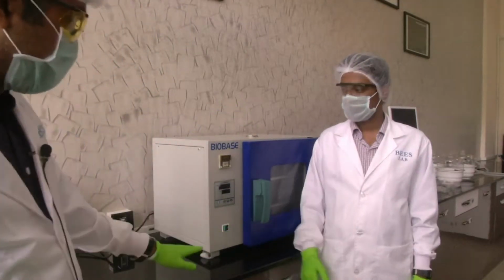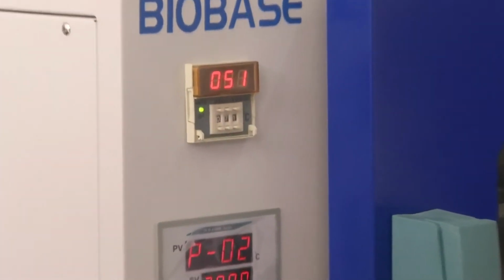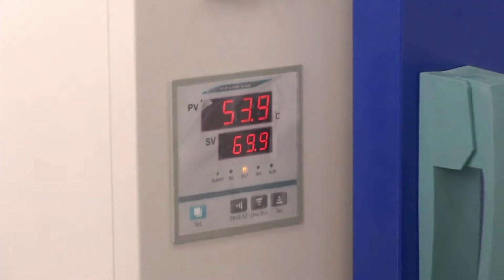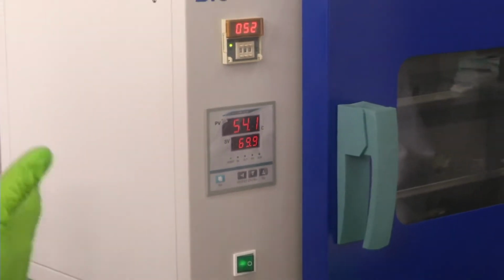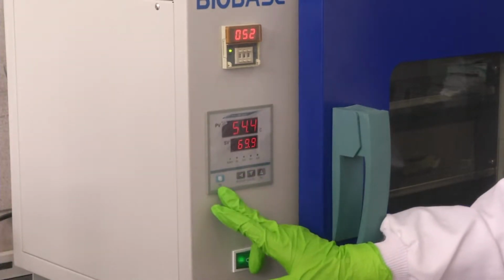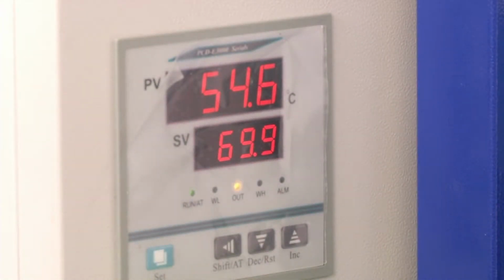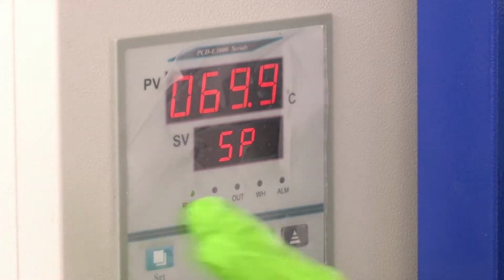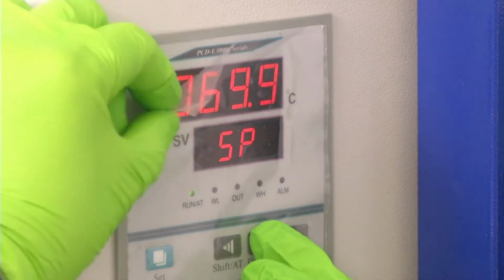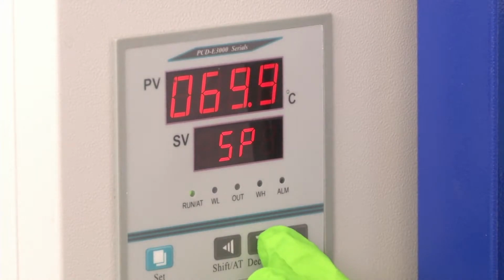Now, let us switch on the equipment. This is the switch. Suman is now switching on the equipment. As and when he switches on, you will hear a sound, that is all the coils, everything powering on. Now Suman will show you where you will set the temperatures. We have a touch panel on top of the oven. There is a green set button which he is pointing to. If you click the set button, you can actually set the temperature that you want.